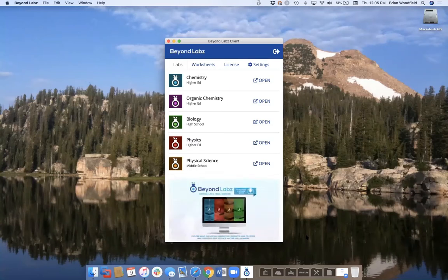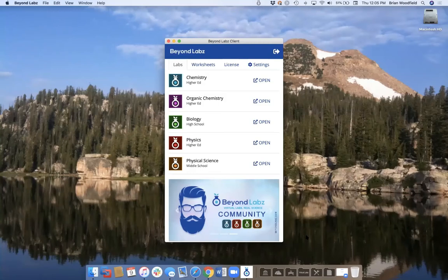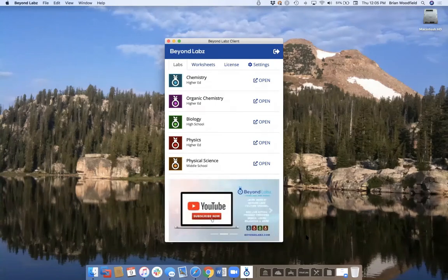I've always used computers a lot in research. And so I figured out an algorithm where I could create an open-ended qual scheme that would allow them to make the same decisions. But I realized that I couldn't teach them technique on a computer, but I thought that the computer would be really good at allowing students to make decisions and suffer consequences.